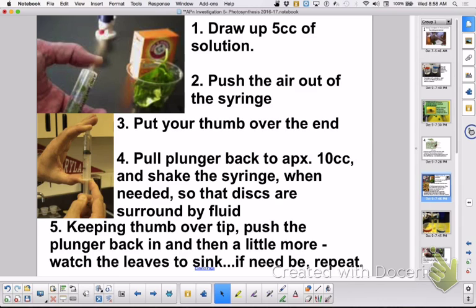So then I'm pushing. I'm continuing to push up on my thumb. Do you see them sinking? And I pulled it out a little bit too far. Did you see the one sinking here on the bottom? So I lost a little bit. Okay, and you want to hopefully do it once. But if you need to, pull again, and I'll be careful I don't pull too far this time. Learn from me.